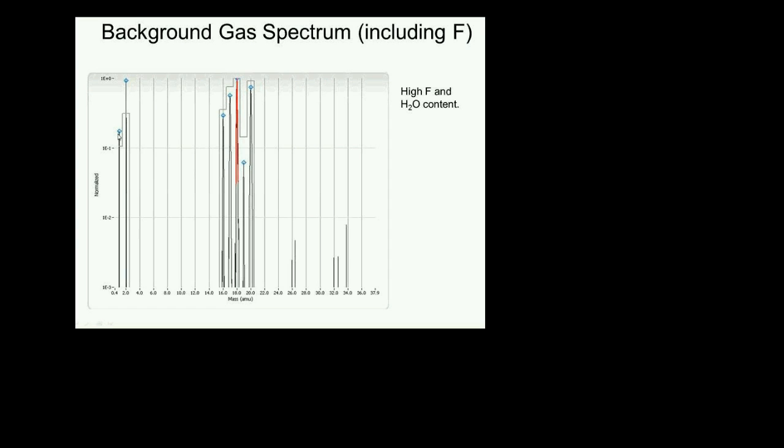This is hydrogen. It will be in just about every vacuum system. You will see hydrogen always because hydrogen dissolves into stainless steel during the manufacturing process, and it will outgas from your vacuum system forever. Your grandchildren will see it. There is no way you're ever going to get rid of this hydrogen from the system.